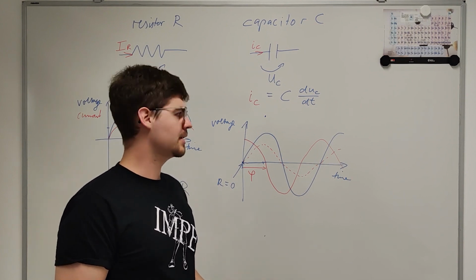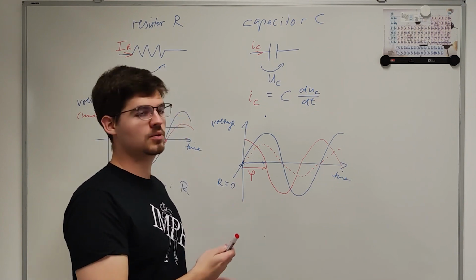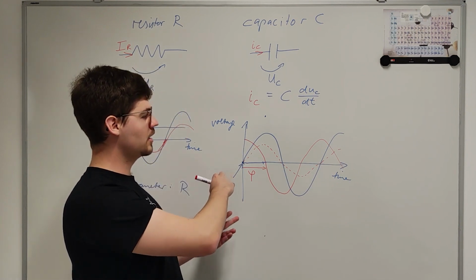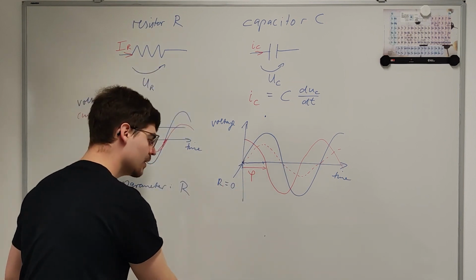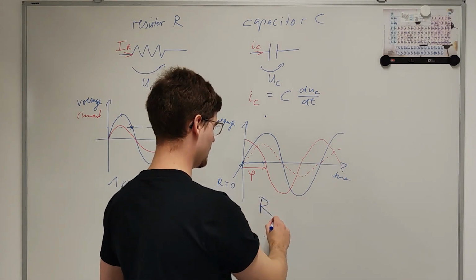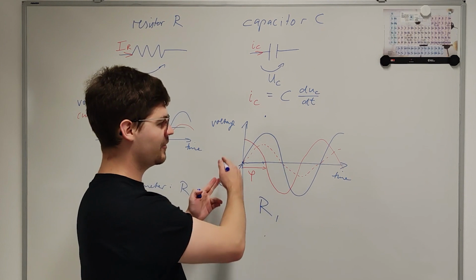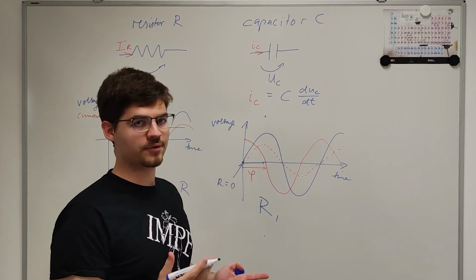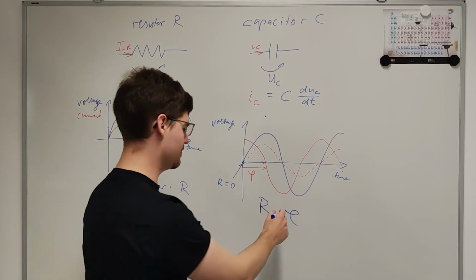So impedance is essentially the description of the current response that we obtain when applying a voltage waveform that is alternating. So we have two parameters, R, which I will continue to call the resistance, but we must phase shift this for this to make any kind of sense. And so we have a second parameter, phi.